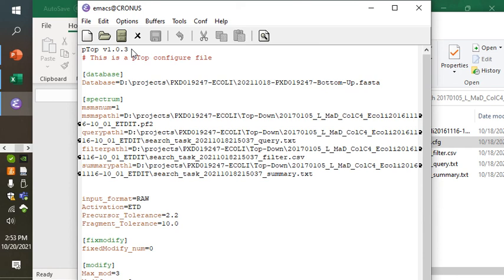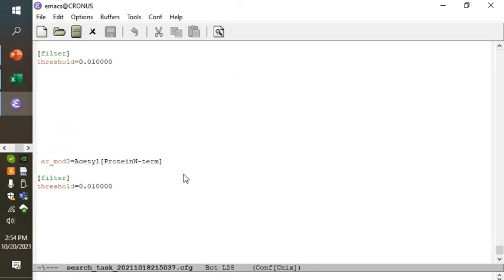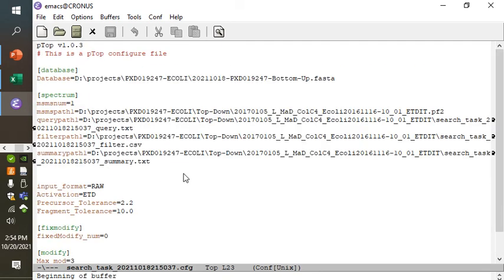It's a little confusing because sometimes we see a version number of 1.2 and other times the subunit parts have different version numbers. We get to see how the MSMS path was set up for doing the pTop run itself, what sequence database was used, because yes, even experienced informatics people forget which sequence database was used for a given search from time to time. We have information about the format, the precursor tolerance.